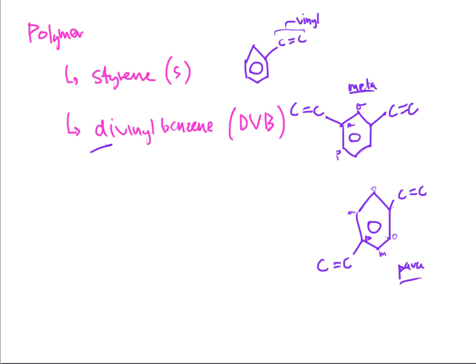So two versions of a polymer here. They're really kind of the same thing. One version has one vinyl group. That's it. The other version has two vinyl groups. And I've got kind of a choice here. I could get a vinyl group that skips one, and you've got a neighbor beside that one. Or I've got a choice where they live directly across the street from each other. All right? So these choices are good enough. That's all that we need. We don't need to make them any better.